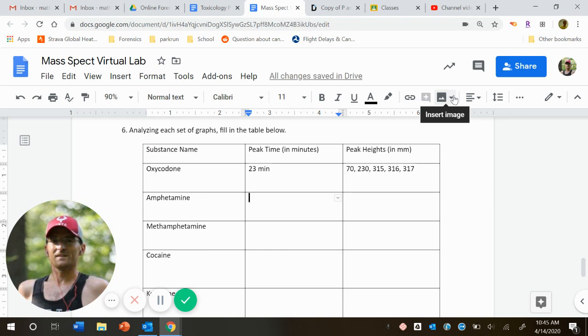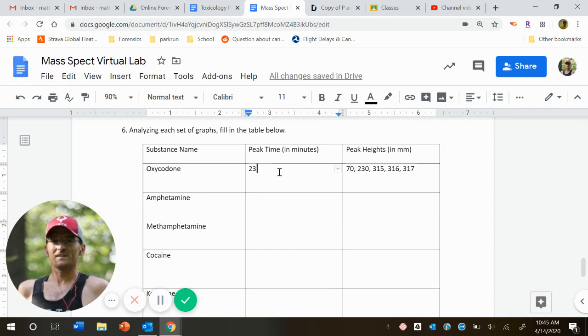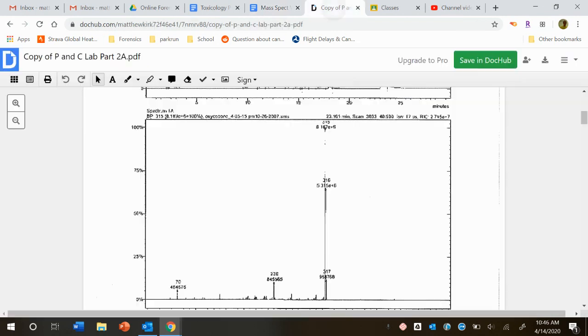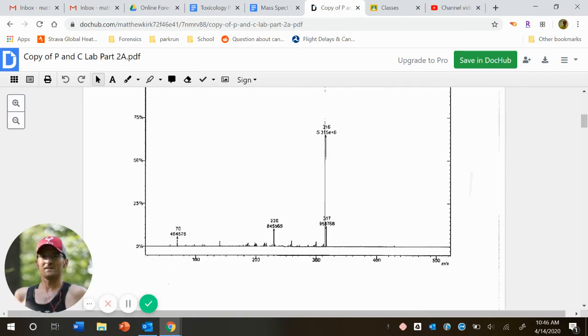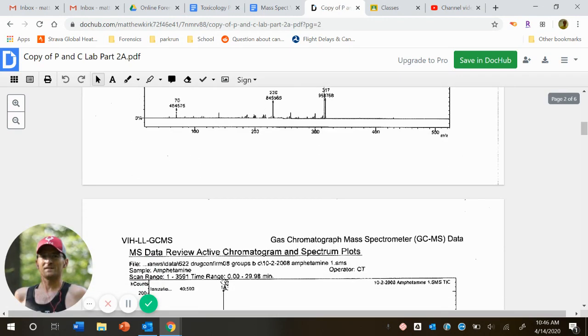And as we kind of said earlier, each compound is going to have unique peaks. Each compound is going to take a different amount of time to get through the gas chromatogram. And then each compound, because they're structured different, is going to end up with different peak heights for the mass spec.